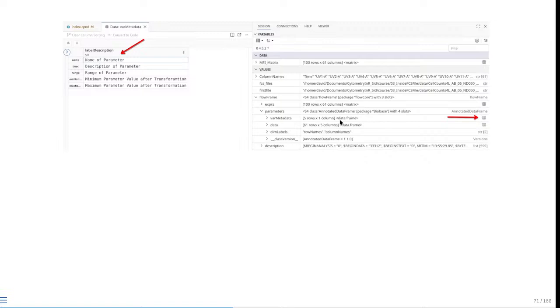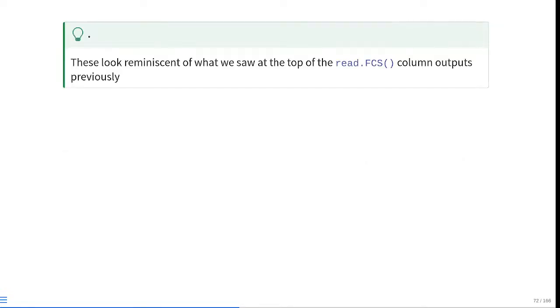They can do a lot more with characters. They're a little bit more multifunctional, which is why we'll encounter them kind of frequently within R. So it's just a good idea to know what a data frame object is. It's one of those intermediate types of objects, somewhere between a simple list and a more complicated flowFrame kind of object for us. So in this case, we kind of maxed out as far as what we're able to see. There's not very much else there, so that seems a little bit simple.